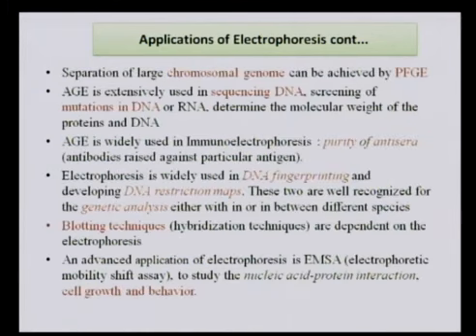Similarly, in addition to PAGE, SDS-PAGE and acetate electrophoresis, we have another variation called PFGE, pulse field gel electrophoresis, which is useful for the separation of chromosomes, genomes and for sequencing studies. In addition, these electrophoresis techniques can be used for DNA fingerprinting and DNA restriction map development, which enables genetic analysis. Similarly, electrophoresis is a major technique which plays a crucial role in blotting techniques.